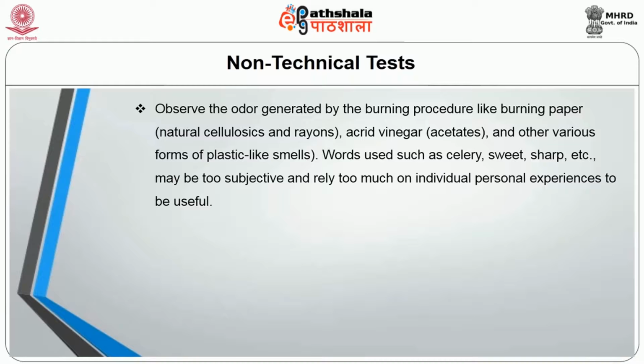Then observe the odor generated by the burning procedure, like burning paper, for example natural cellulosics and rayons, or acrid vinegar like acetates, and other various forms of plastic-like smells. Words used such as celery, sweet, sharp, etc. may be too subjective and rely too much on individual personal experience to be useful.